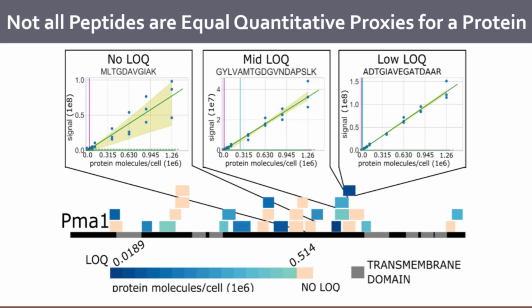Yeah, so the difference is, let me try to straighten this out. You're saying precision. So reporting precision is what people have kind of defaulted to for some of these things. One point I'll make is that you can actually have a precise measurement that is below your limit of quant, unfortunately. So that's the challenge here: how do you ensure that it's above the limit of quant and in that linear range? Our limit of quant has to satisfy two criteria. It has to be above the limit of detection, and it has to meet some minimum precision criteria. So we're taking that one extra step.